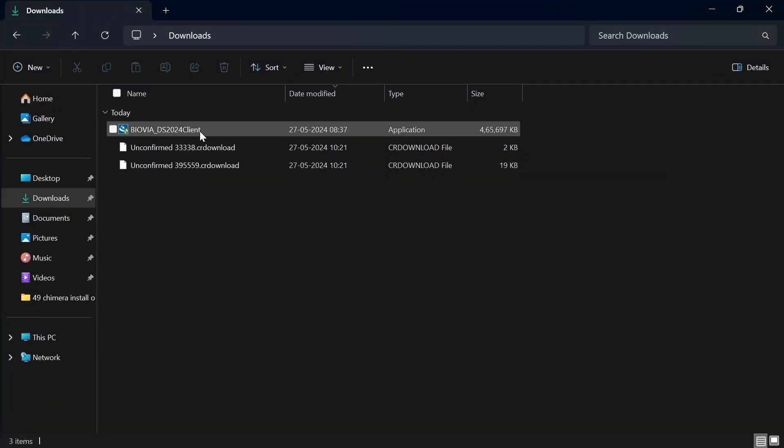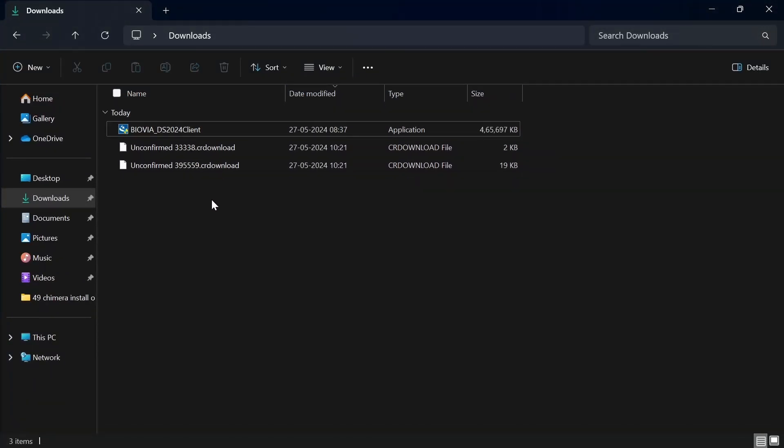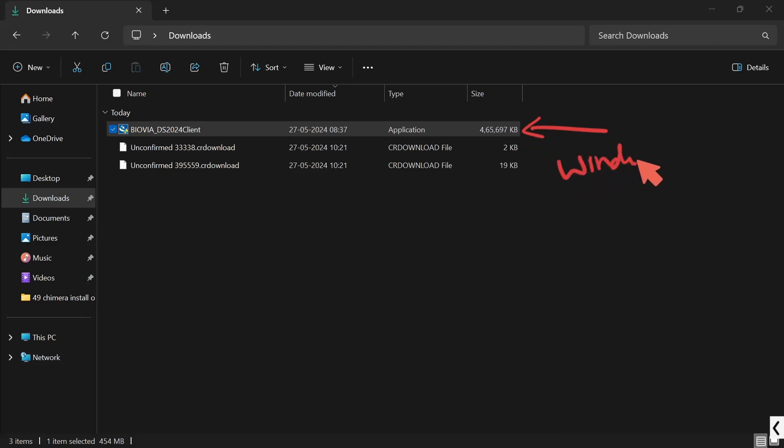I have downloaded earlier. This is the file that I have downloaded. This is the Windows exe file. Don't download the other file.